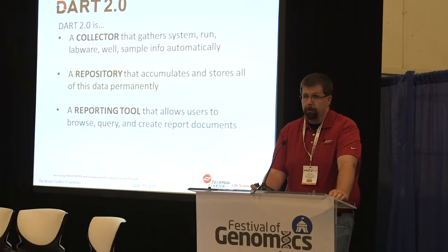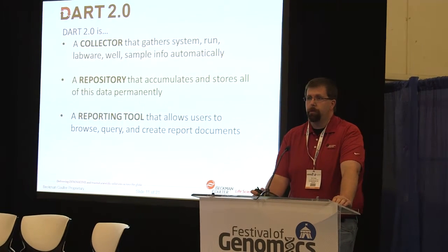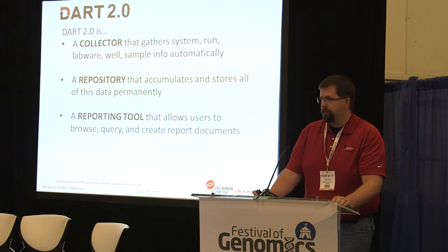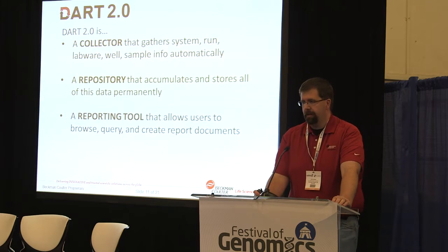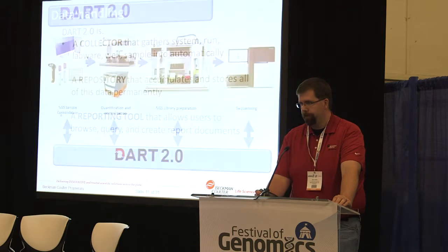DART's also a repository, so it works directly with a Microsoft SQL database to accumulate and store all that data. The data cannot be removed from the DART repository. And it's also a reporting tool, and this is one of its better functions: it allows the user to browse, query, create reports, and keep track of all that data in real time.